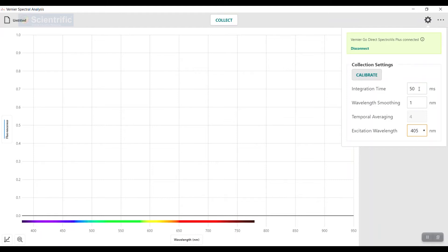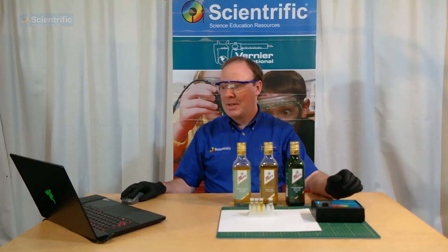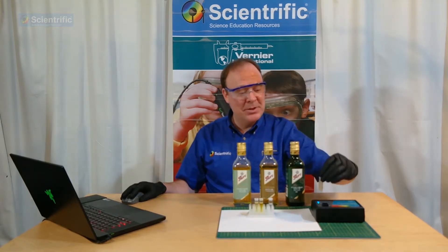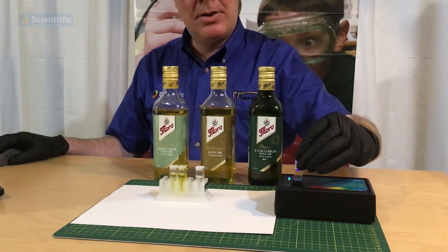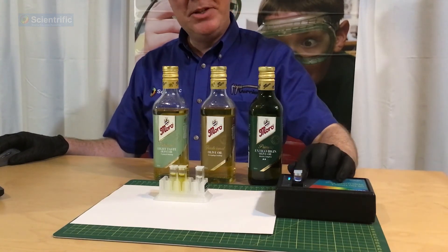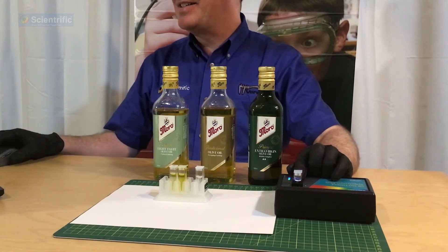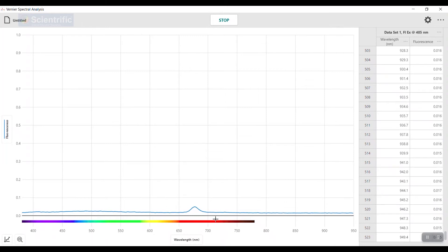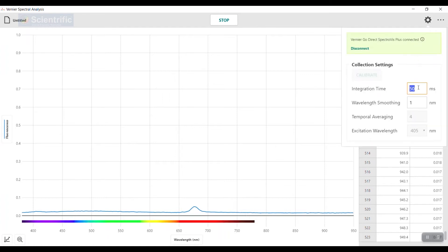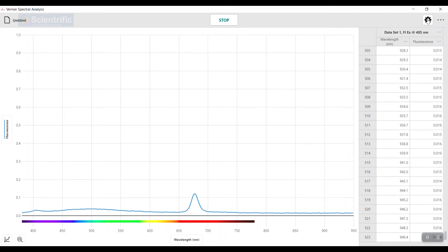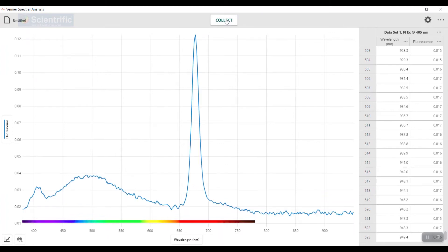First, I'll hit collect. Right now, since we have nothing in there, there's nothing to see. I'm going to take our first cuvette, which has the light taste olive oil, and pop that in. You may notice it's glowing a little bit as it fluoresces, but we only have this tiny peak on the screen. Since I want the peak to be taller, I'm going to change the integration time to 100. There we go—we have a nicer peak. I'll stop that, and there's our peak.